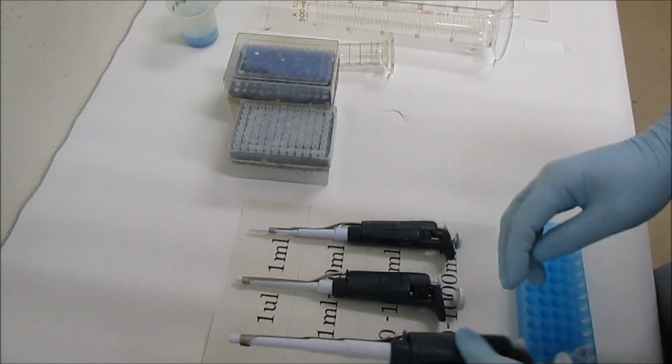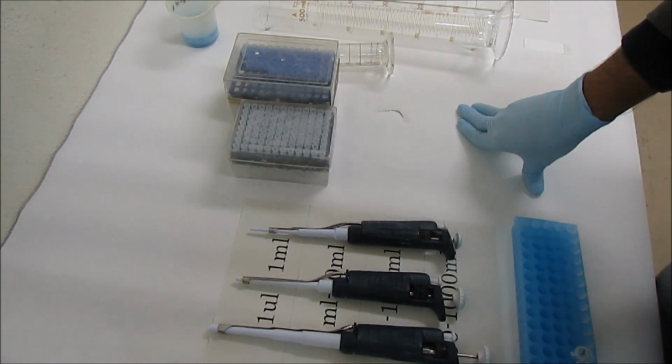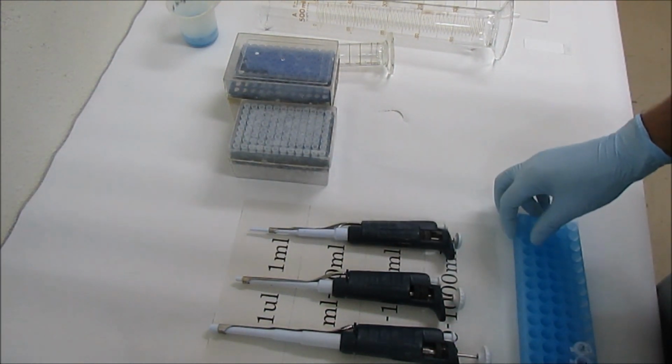Now, how to work with the pipettes. This is very important. Now I'm going to show you how to work with the pipette.